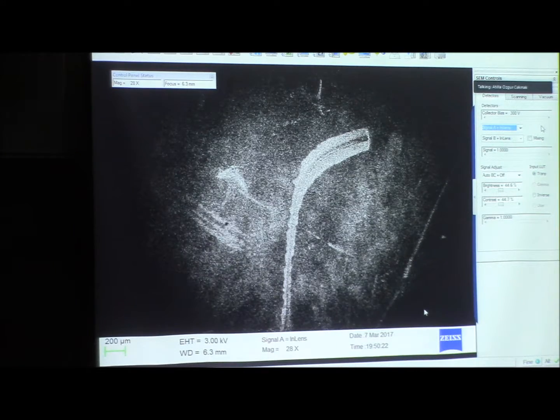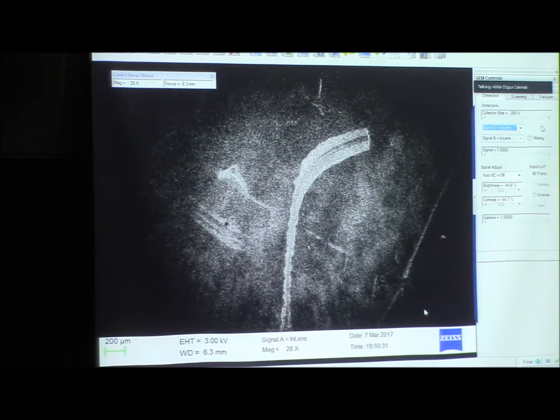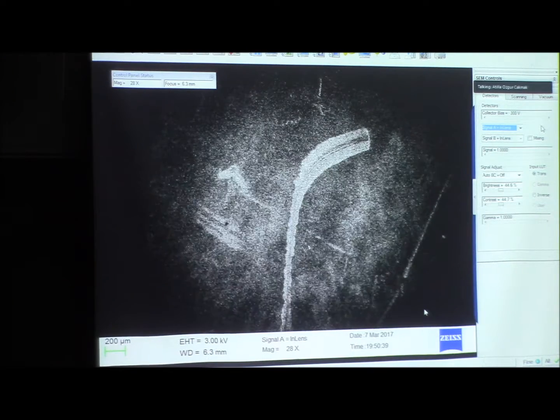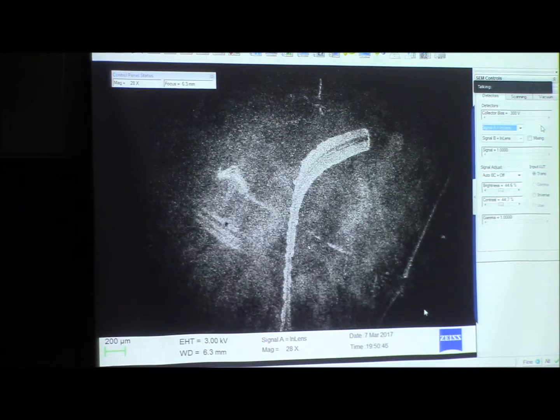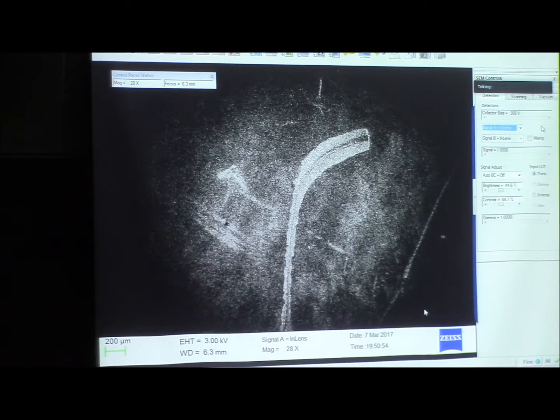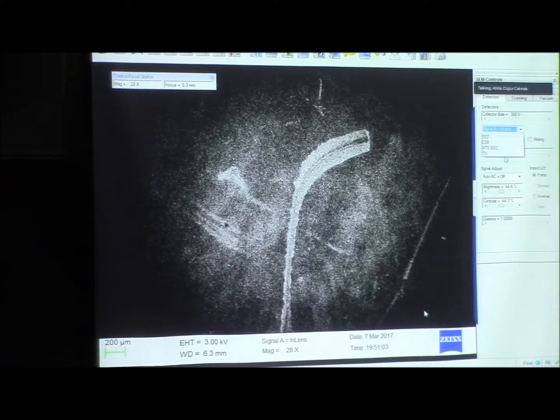Yes, yes. Otherwise, in Spain we say that it's like you're trying to kill a fly with a shotgun while blindfolded, right? Yes. You need a miracle to kill the fly. But this SEM and these nano characterization tools give us the ability to get the fly and to really control all the parameters of the process. Very good. Thanks. Okay. So if that's good, we can go to the next sample.